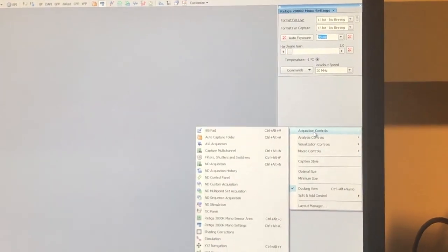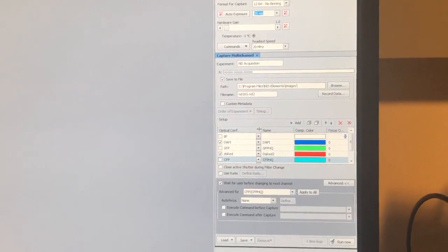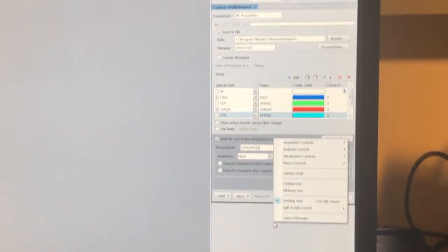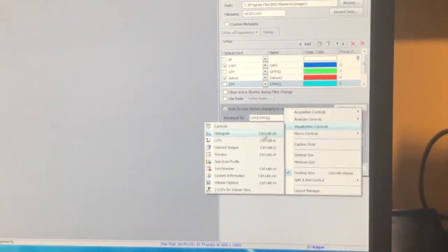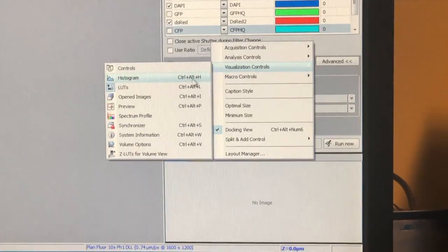Right-click again on the docked area, select Acquisition Controls, and Capture Multi-Channel. Then we're going to click Visualization Controls and click LUTs and Histogram. And then there you are.